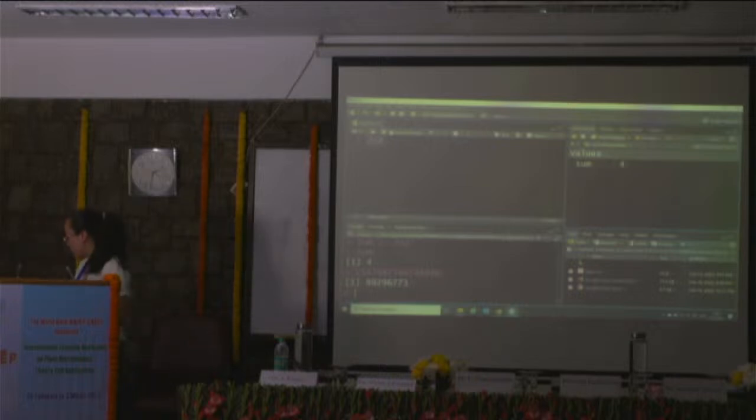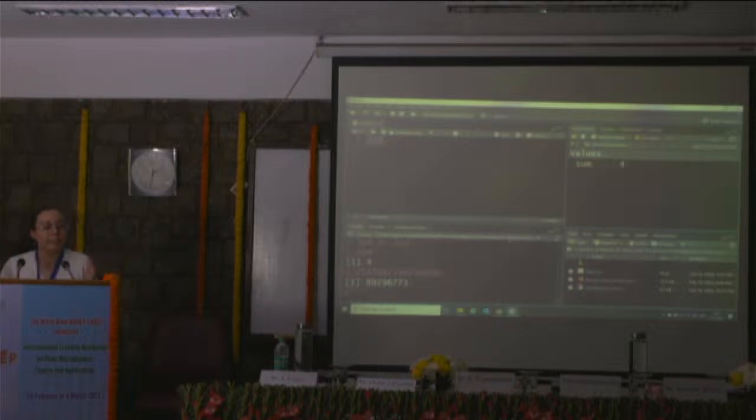So if I go to my PC and I open the folder and I follow this, then I click on this, desktop, this folder, this one, I'm going to find that location, right? So that's where you're running it, and it happens that I have also these files exactly there, where I'm running R. So I can open them, you can see them there, you can upload data from there. We're not going to get into it too much, but it's a way to interact with the files that you have in that directory or folder.